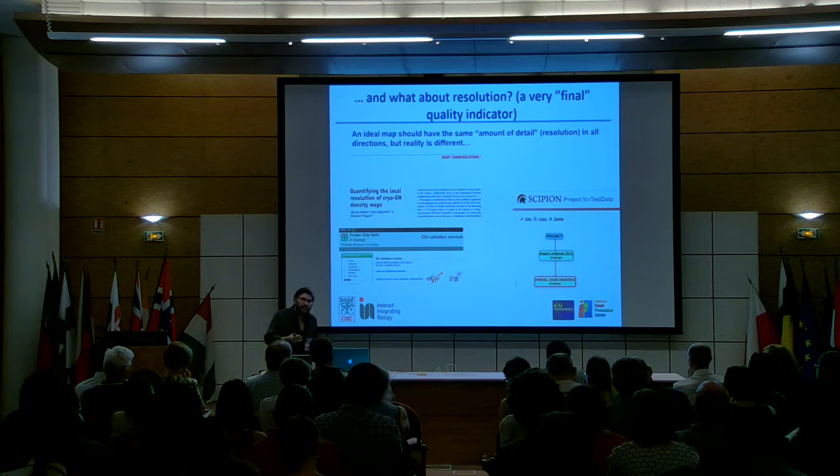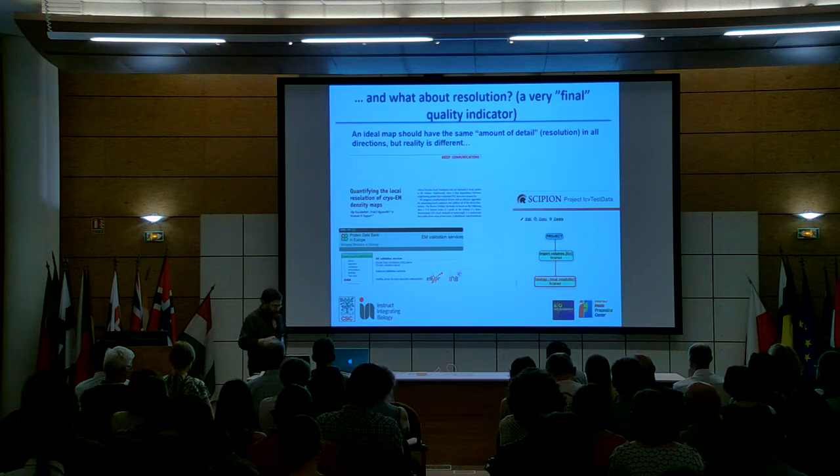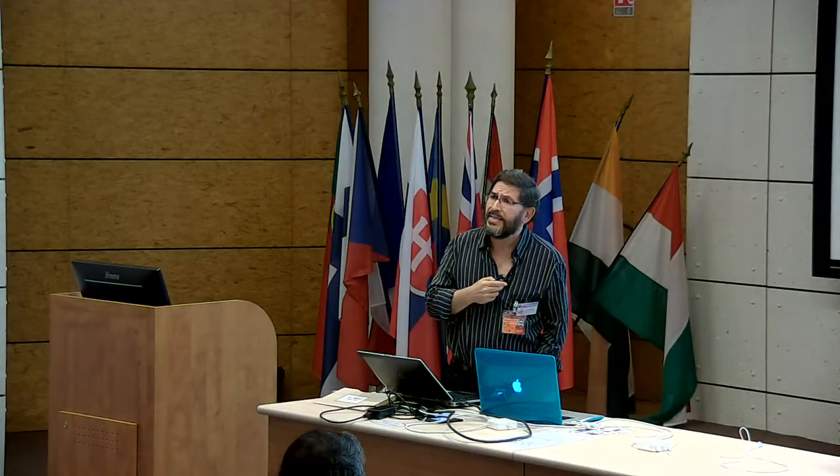But many times they are going to have a very deep biological meaning, because that region of the map is simply more fluffy, more flexible. ResMap was the first approach to get that, and it's a very successful approach.